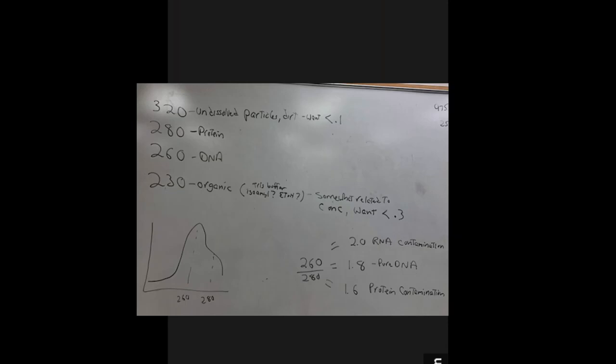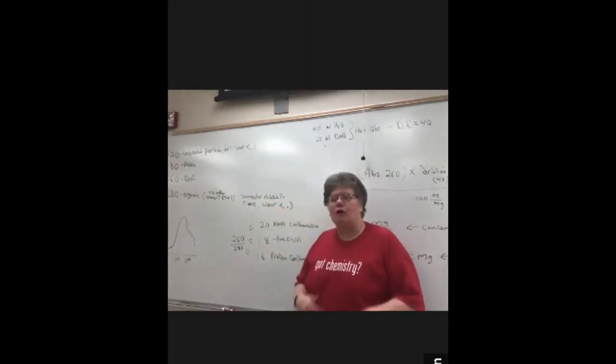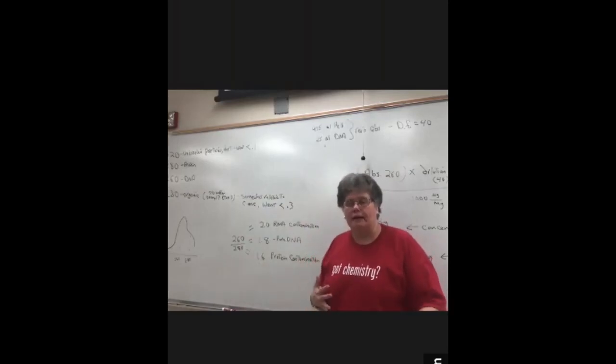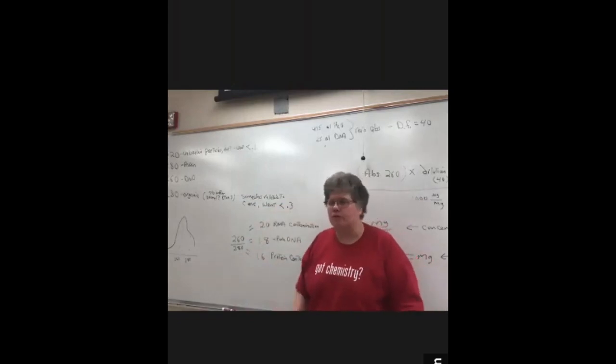So as long as your absorbance is less than approximately 0.3, with that, you're probably in a fine range. If it's higher than that, maybe you'd want to try reprecipitating your DNA to remove any organic contamination. But you would expect to see some absorbance in there.